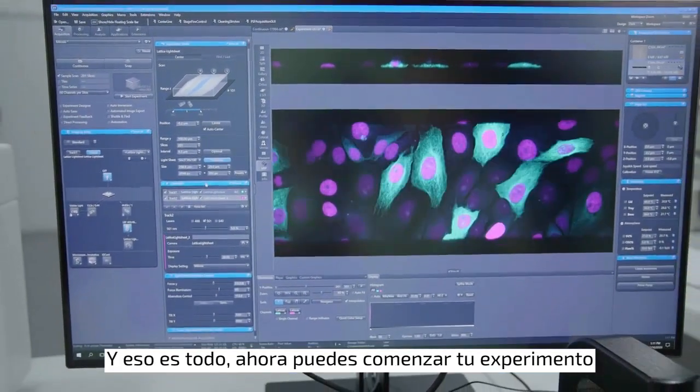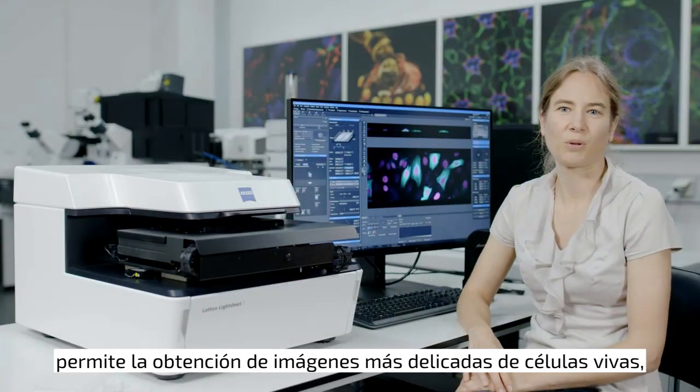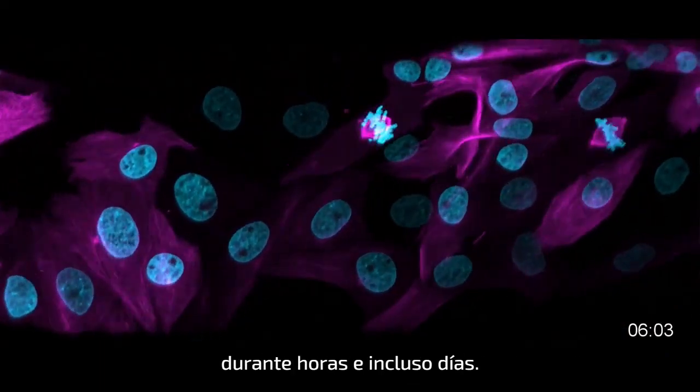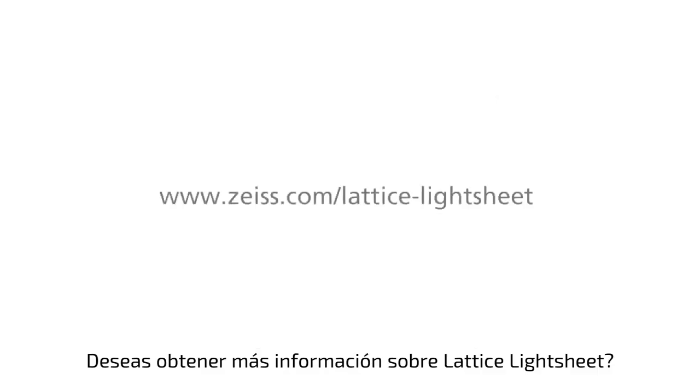And that's it — now you can start your experiment. This amazing technology allows for the most gentle imaging of live cells. You can image subcellular dynamics over hours and even days. Want to learn more about lattice light sheet microscopy? Please visit our website.